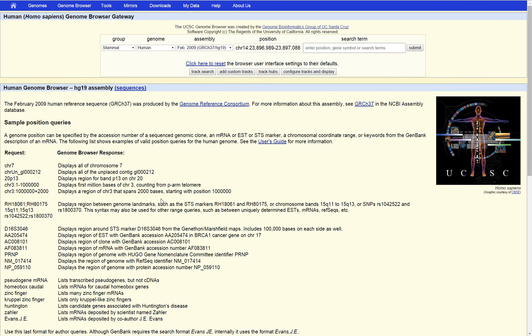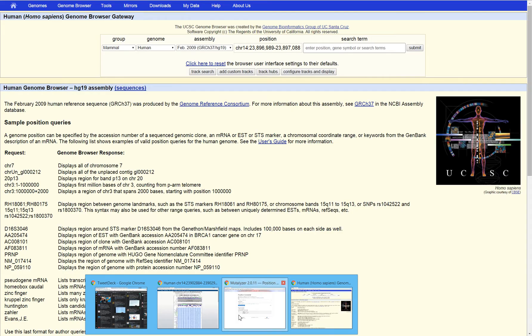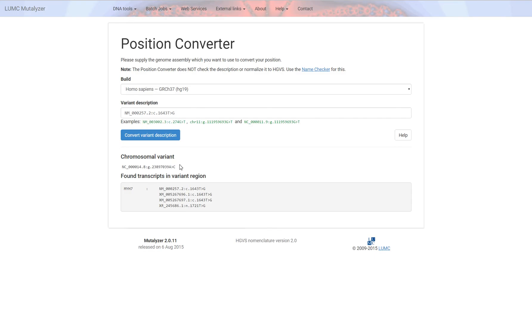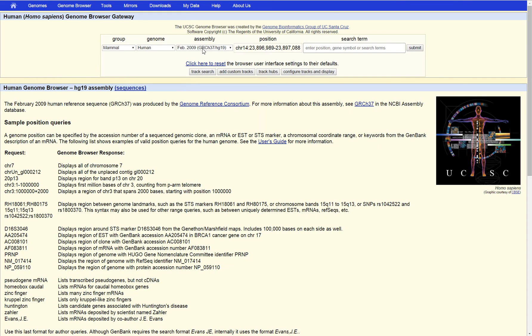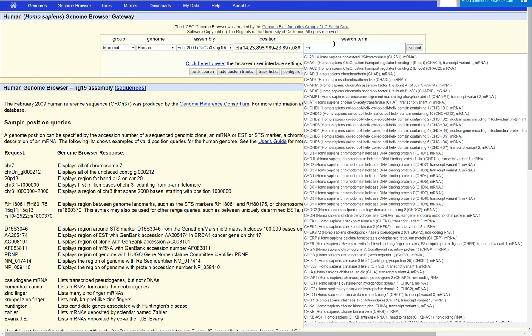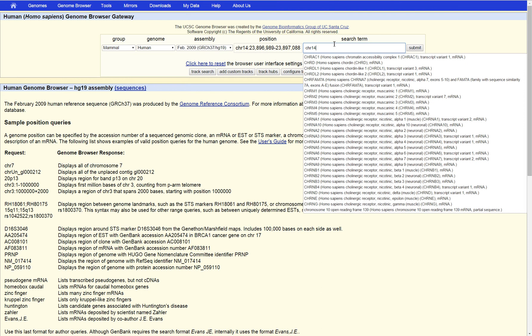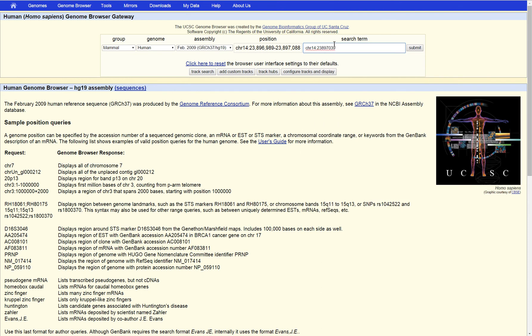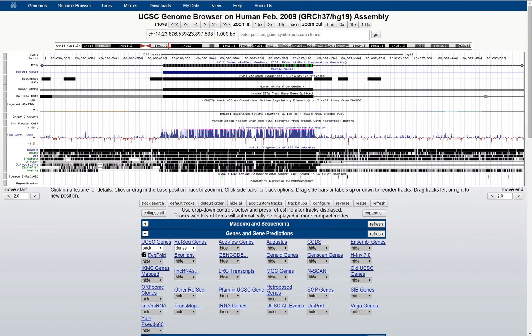Next I'll show you how to look up a variant's conservation in other species directly through UCSC. I'm not going to proclaim to be much of an expert in UCSC, but I'll show you a few ways I'm familiar with searching for a variant, although there may be better ways to do it. Relying on the genomic coordinate to look up the variant is one way, in the format of chromosome and then the specific variant location.